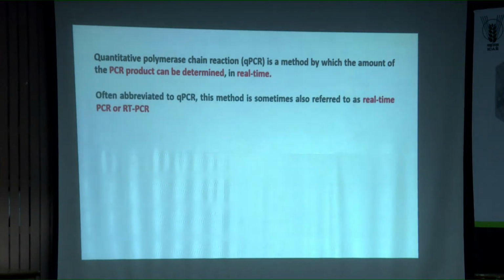Often it is abbreviated to qPCR, which I already emphasized here. This method is sometimes also referred to as real-time PCR or RT-PCR.